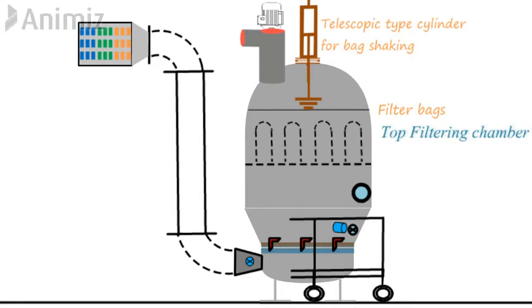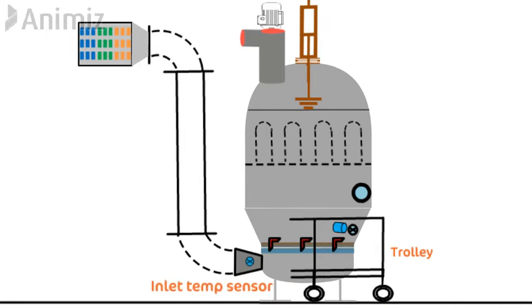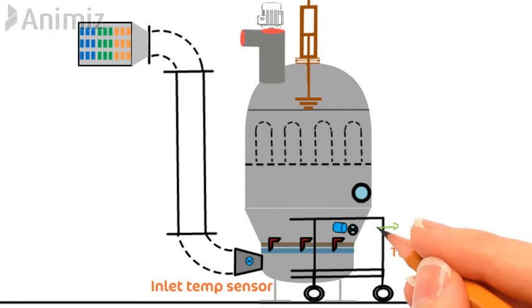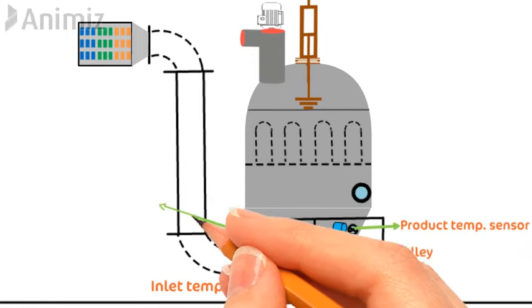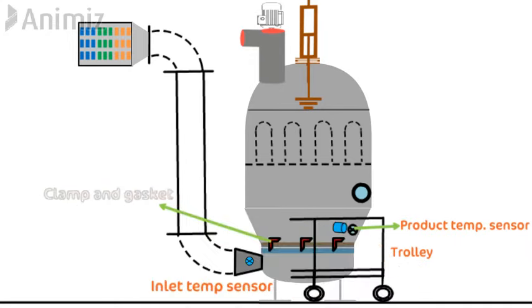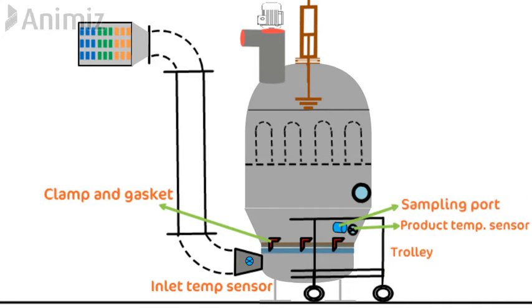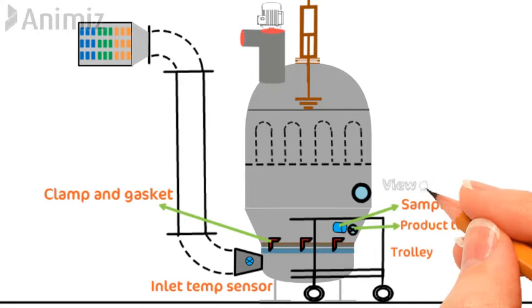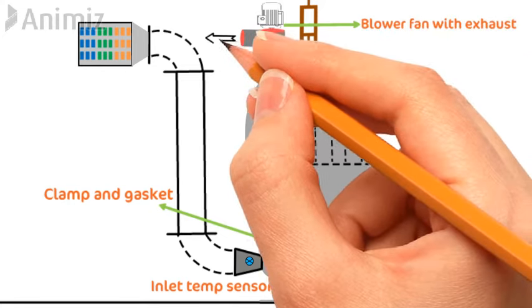Other accessories include a trolley attached to the product container for loading and unloading of the product. There is an inlet temperature sensor which controls the temperature of the inlet air, and a product temperature sensor which shows the actual temperature of the product. Stainless steel clamps and rubber inflatable gaskets provide complete sealing of the product container with the bottom wind inlet chamber. There is also a sampling port for taking out samples, a view glass, and a blower fan with exhaust at the top for exit of the air.